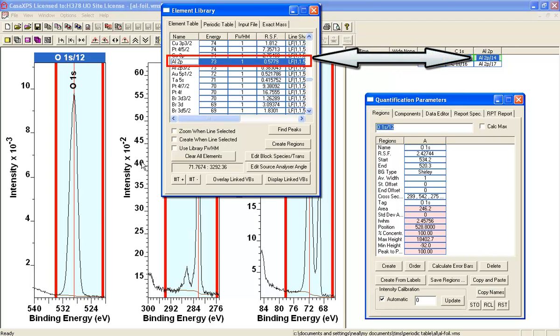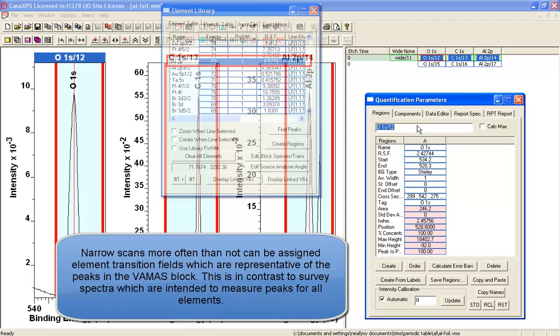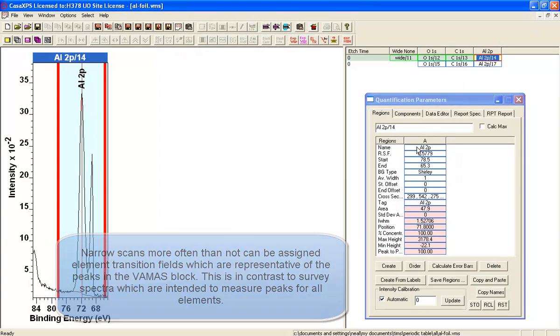in terms of oxygen 1s, carbon 1s and aluminum 2p has allowed the element library to load the appropriate sensitivity factors for these elements.